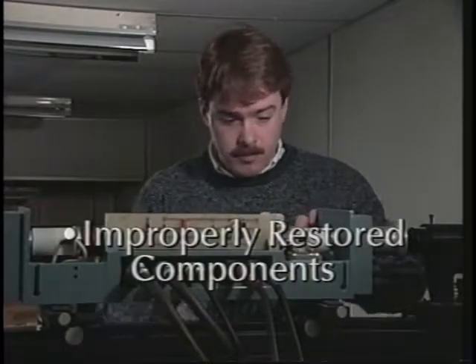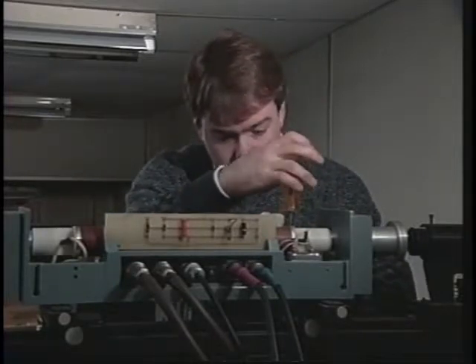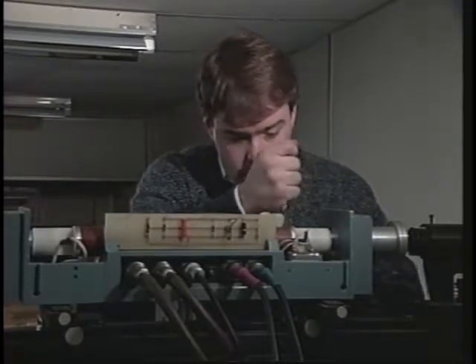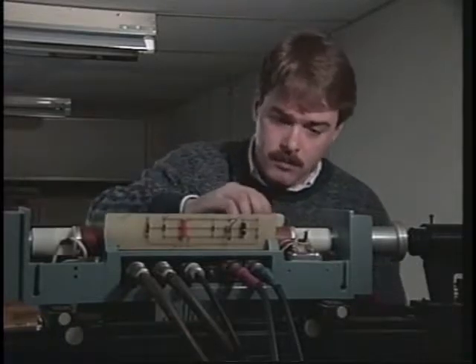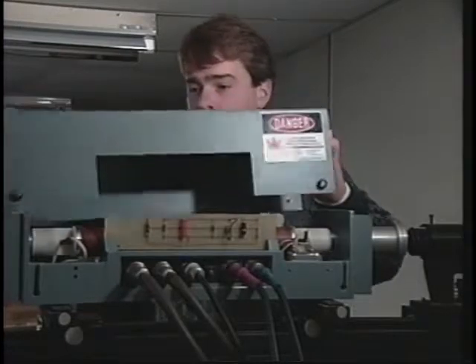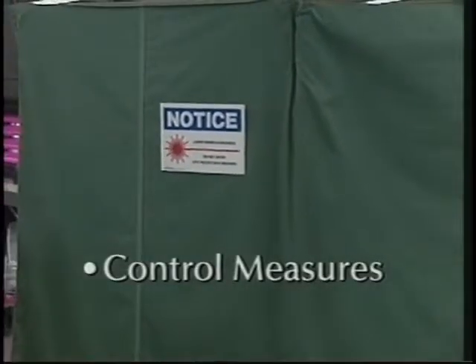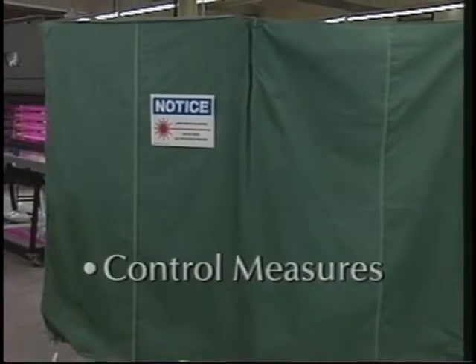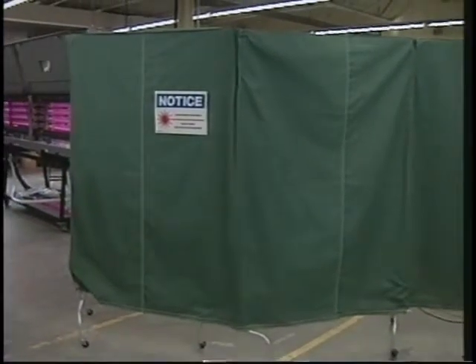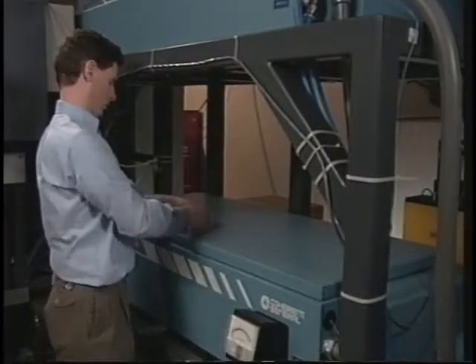During maintenance or service, it may be necessary to access the laser beam. This requires the removal of protective housings and service panels, and the defeat of interlocks. After these procedures, housings and panels may not be correctly replaced, which means that a potential hazard exists for the equipment operator. During maintenance and service, use a temporary barrier to control errant beams. After completing maintenance or servicing, check that the interlocks and protective housing have been properly restored.